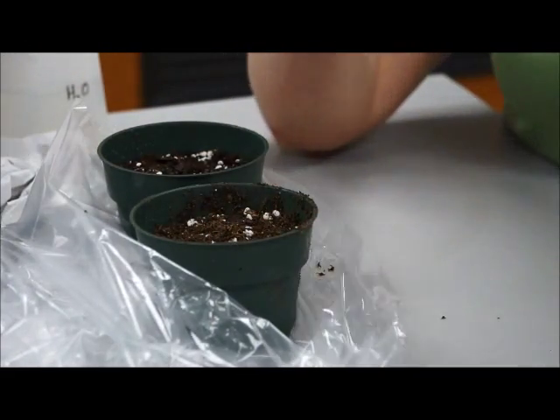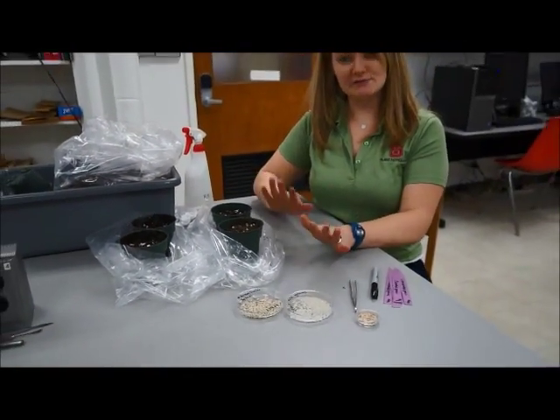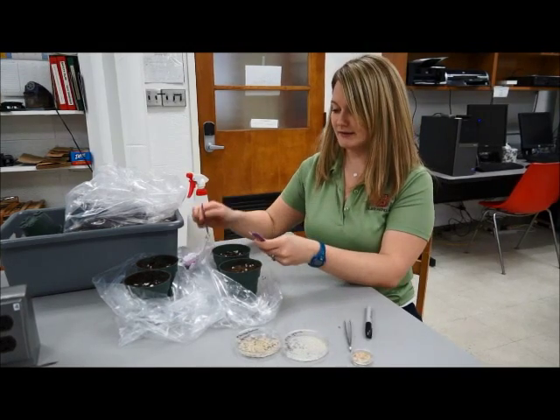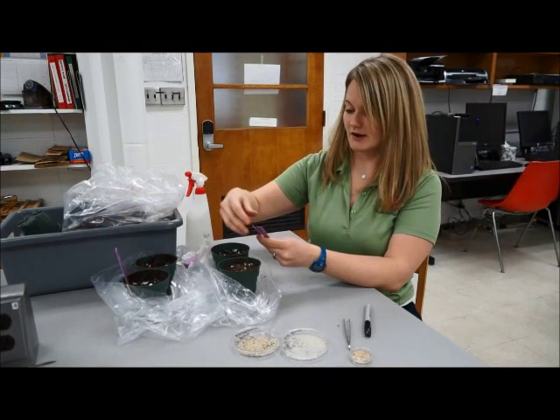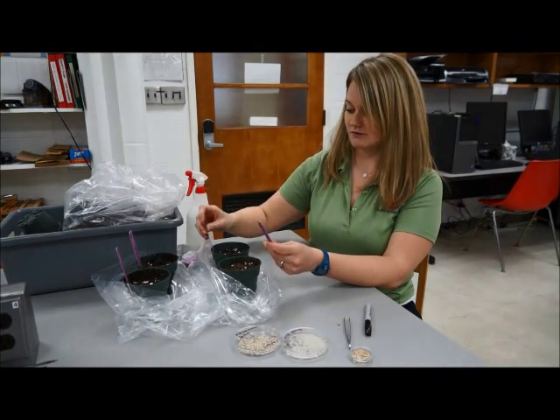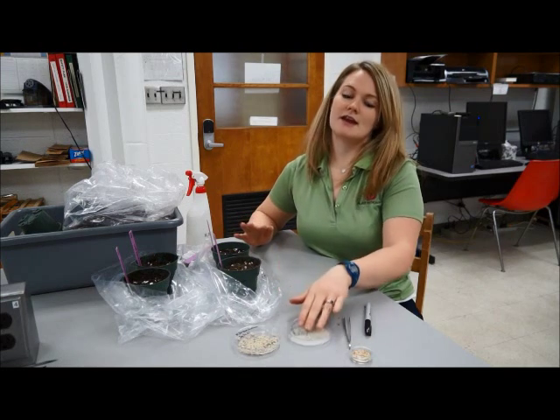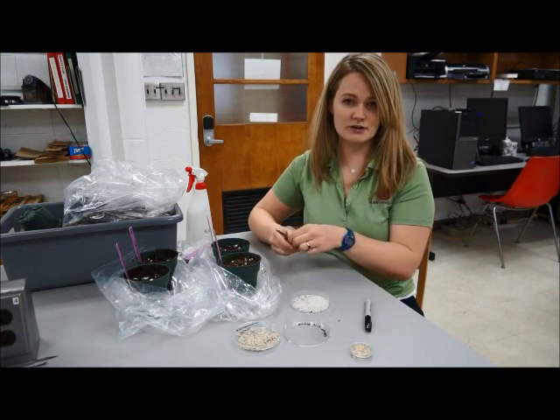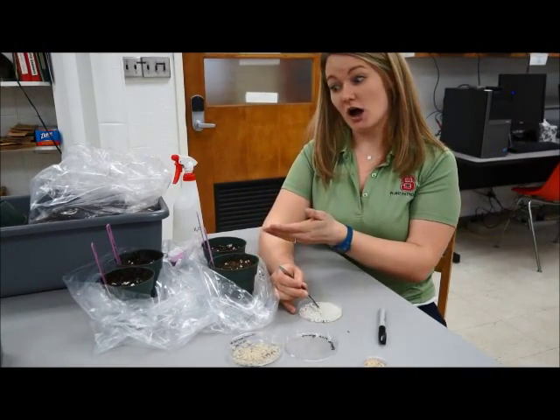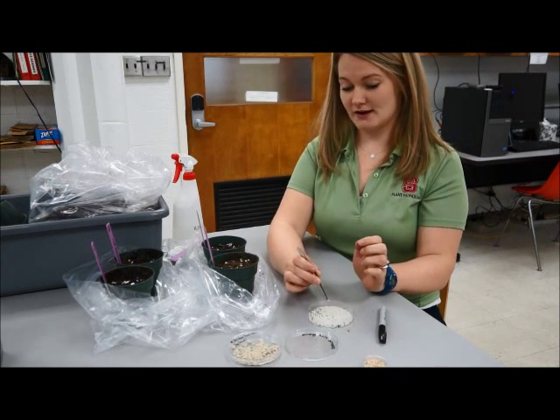We have four pots here that we have treated exactly the same, and that is very important for our experimental design. We don't want any differences except in our rice grains. I have four pot labels, and I'm going to place them now. We have inoculated grains in the back — one inoculated and three inoculated rice grains — and our controls in the front with one and three rice grains. Negative controls are very important in your experiments. Without one, how do you know that what you're seeing is actually caused by the rice grain or any treatment you're applying to your experimental unit? So you have to have your negative control.